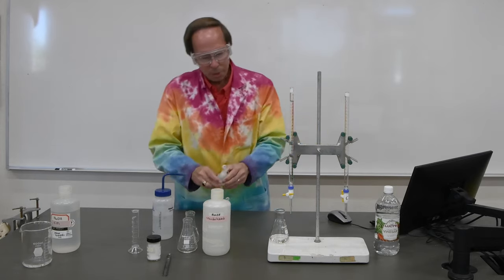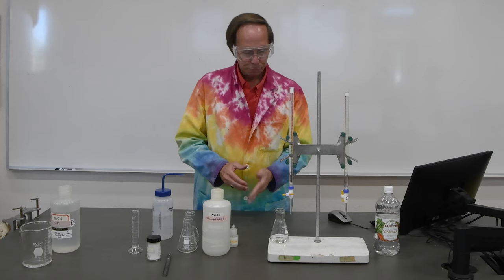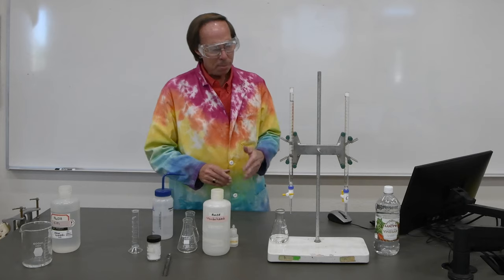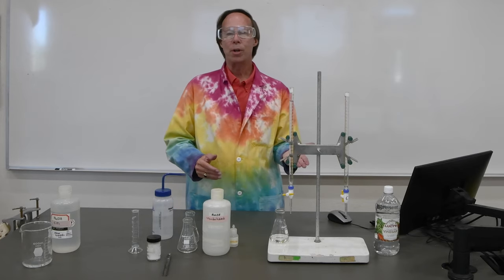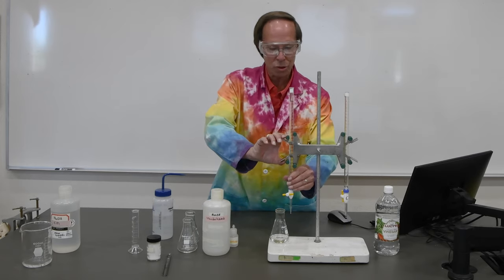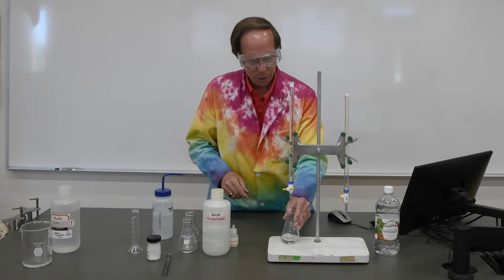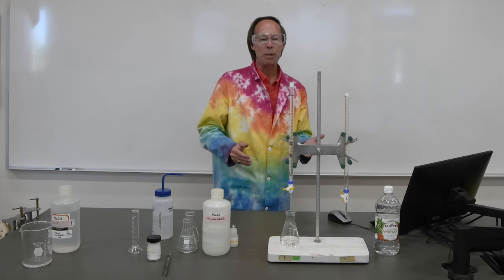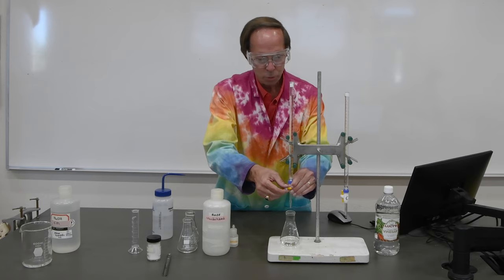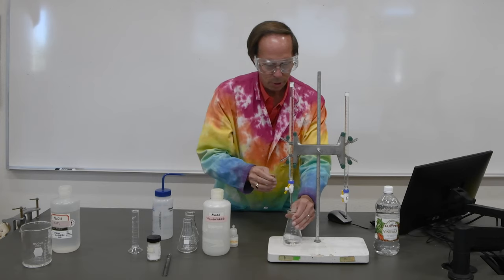Now we know that the sodium hydroxide solution is approximately 0.3 moles per liter. We weighed out 0.95 grams of KHP, and that means that it should be somewhere in the ballpark of 13 milliliters to reach the endpoint of the titration. If we've done this correctly, then that's about how much it should take. So we're starting at the zero mark. We can add fairly rapidly at the beginning, but as we get close, we'll slow down and go one drop at a time so that we don't overshoot our endpoint. So let's go ahead and begin to add our sodium hydroxide. We'll swirl it.